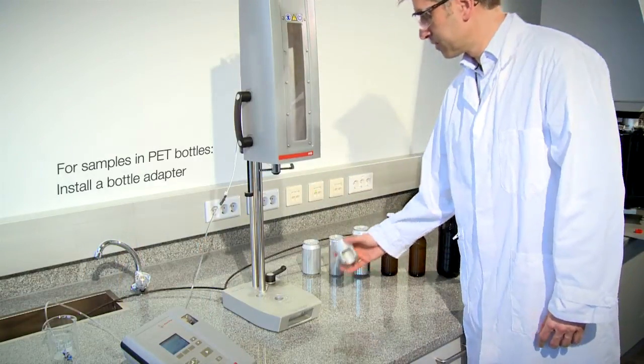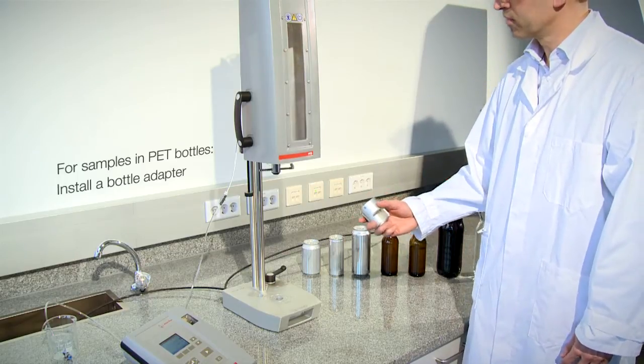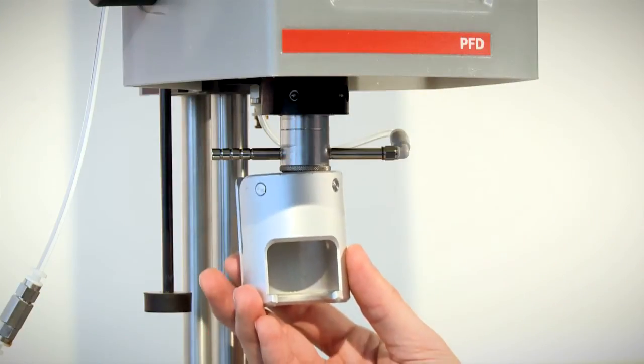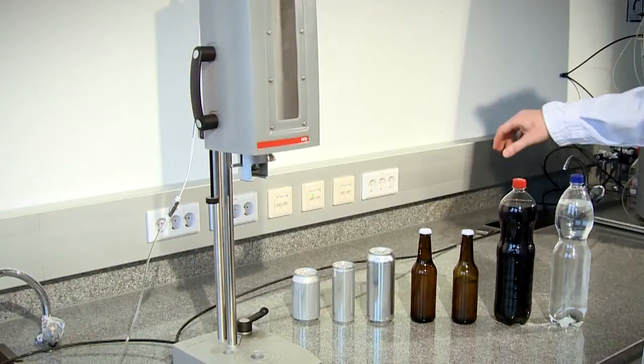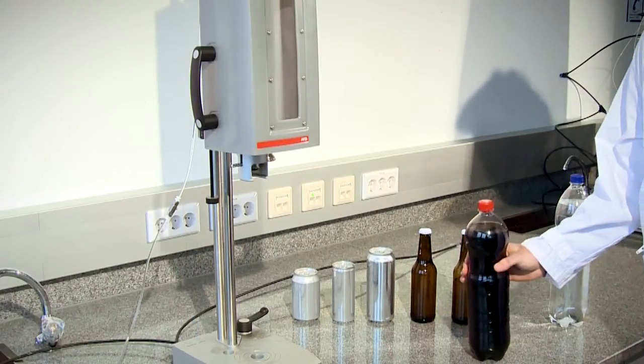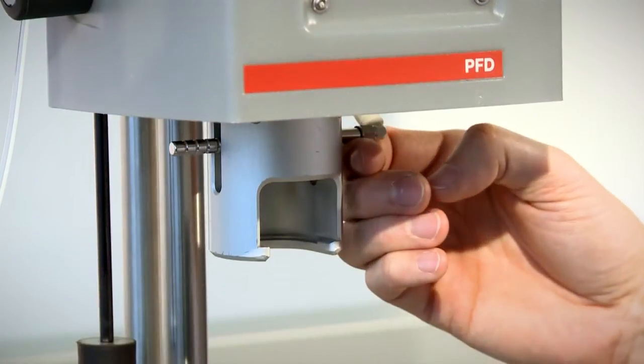For measuring a sample in a PET bottle, you require a so-called PET bottle adapter. As you can see, the adapter is easily installed. Now you can insert the bottle by fitting the cap into the adapter.